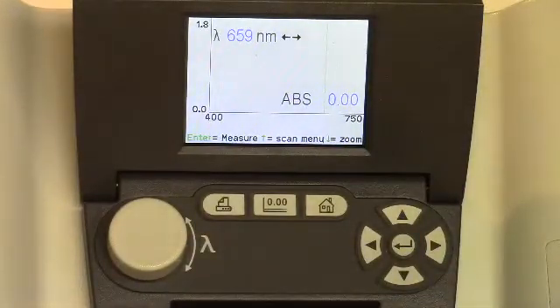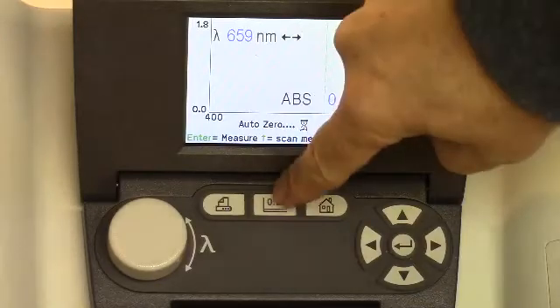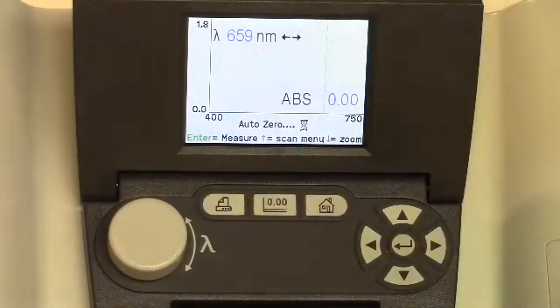So I'll put that into that little compartment that I just showed you a moment ago, and then we're just going to hit the auto zero button there, this one right here in the center, and it just takes a few seconds there for it to zero. Once that's done, we don't really need to re-zero it every single time. We can then just put in our samples and scan.